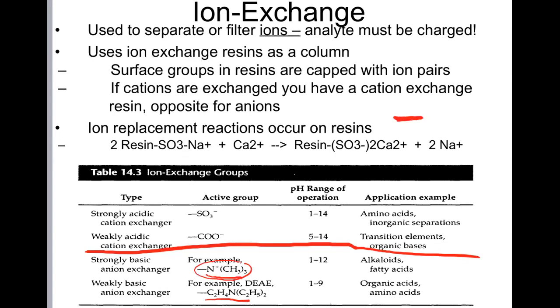So first off, there's a bond to that nitrogen, and I'm going to call this R prime, whatever it is. R is like the rest of the molecule, the rest of the polymer. I need to use one of my bonds to the nitrogen just to tie this charge group to the resin. So that's what I'm going to use, okay? And then in addition to that, I've got 3 bonds to methyl groups, methyl group here, here, and here. 3 of them. This type of arrangement yields a positive formal charge on that central nitrogen. It's called a quaternary amine. It's basically a permanent positive charge, okay?